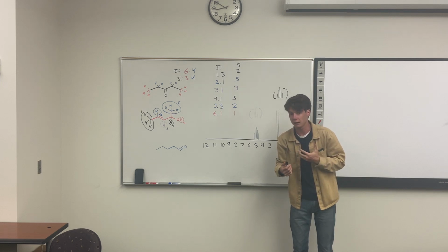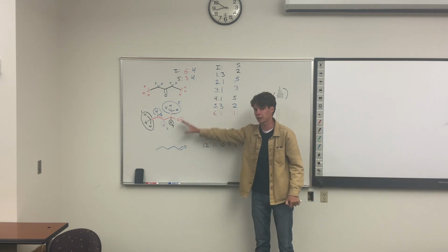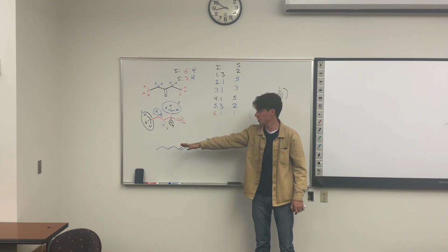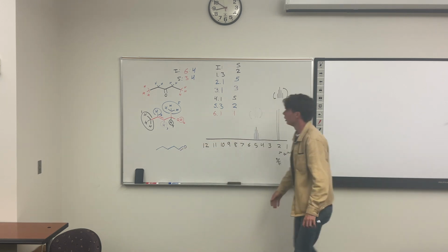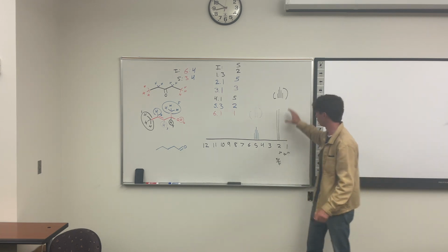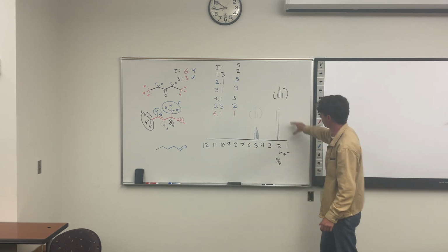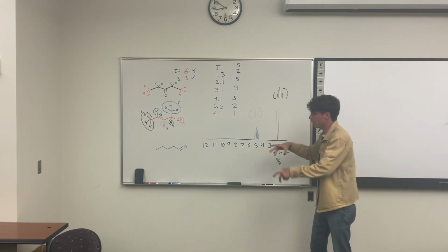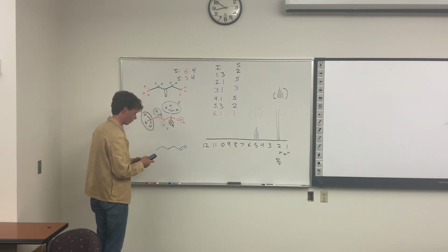Clearly, I did not design these in a great way. I just wrote them up there. And if you notice, they all have the same chemical formula, C5H10O. So that's good, but what I didn't account for is these overlapping. Take this down here, in real life it's going to kind of merge. Muddy the waters.